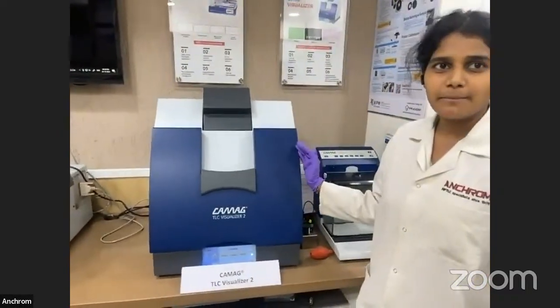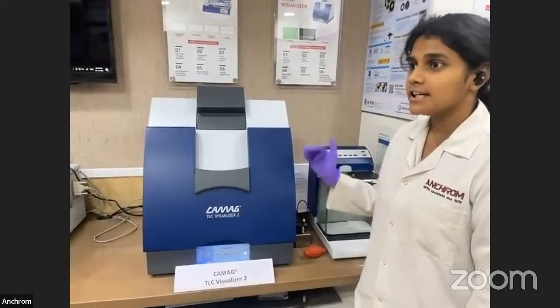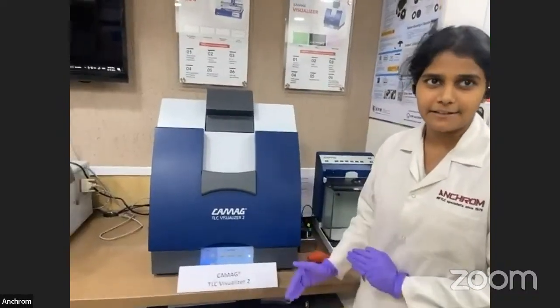So as we have captured the plate image under three different illuminations, now we'll proceed for DPPH activity.